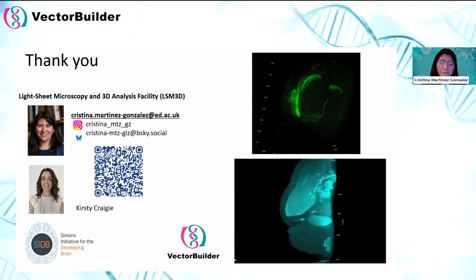Our next question is how do you store the tissues that are cleared with different methods and labeled with antibody? And also, how long can those tissues be stored for? For example, any of the DISCO methods, iDISCO, uDISCO, RatDISCO, at the end they are stored in something. You can store them in solvents, which are toxic, or we can store them in ethyl cinnamate, which is not toxic.